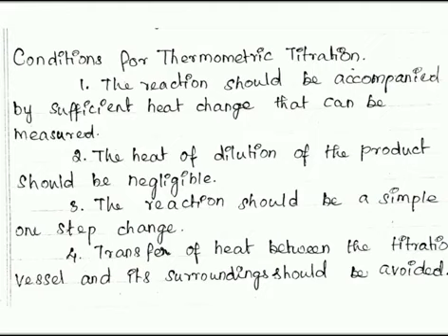The first one is the reaction should be accompanied by sufficient heat change that can be measured. And the second one is the heat of dilution of the product should be negligible. Third one is the reaction should be a simple one step change.